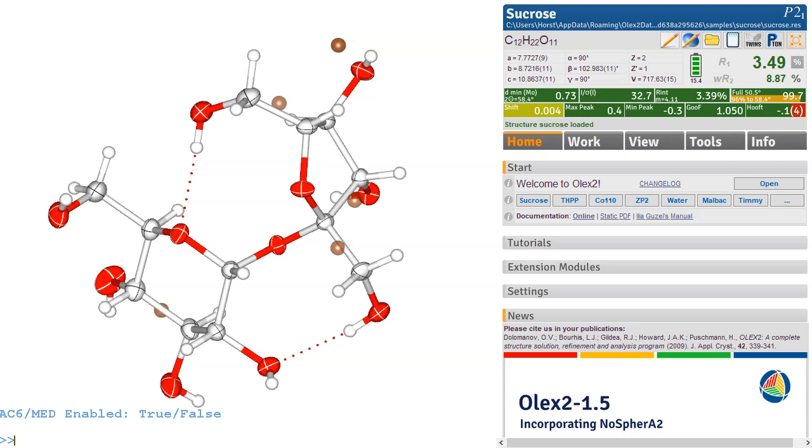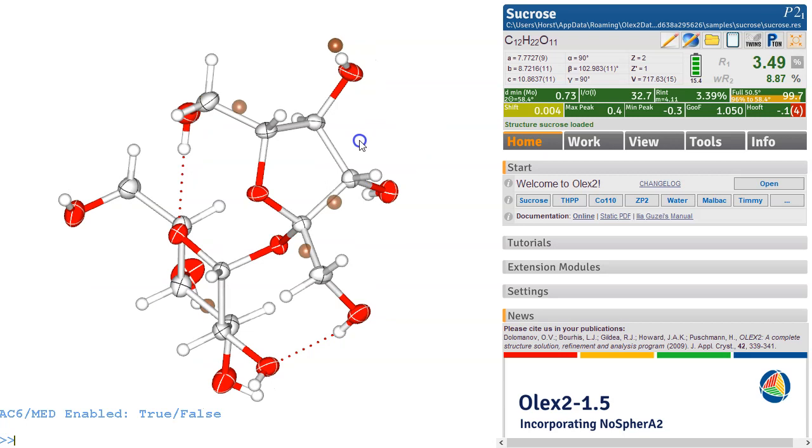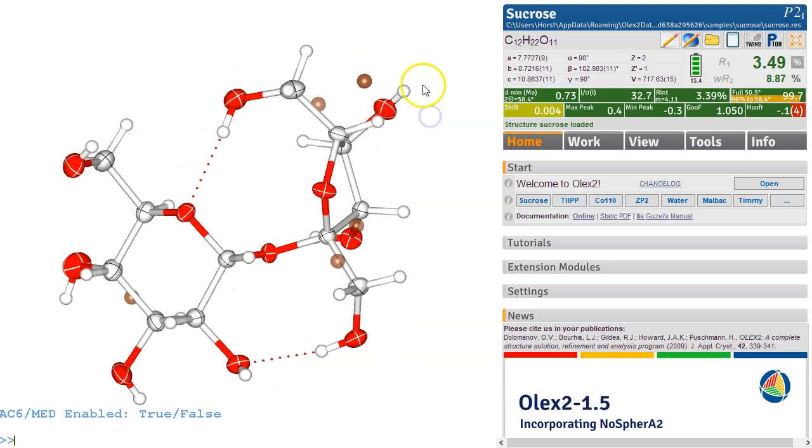I took part in the Jaca crystallography school in Spain recently. It's a fantastic school, and they also had some really nice example structures, and I promised to make some videos out of those. So this is the first.